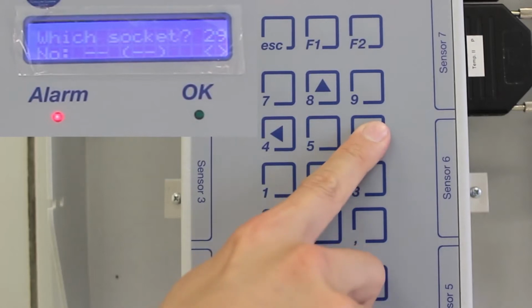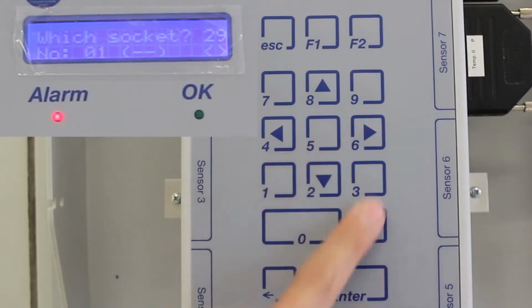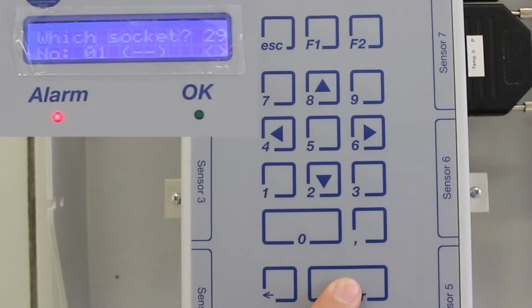Now, allocate the function to the socket where you plugged the power supply of the solenoid valve. For example, you've plugged the solenoid valve to socket number 1, and the following will show on the display. Select this socket. Sockets with no control settings yet have the following shown beside the number. Lastly, confirm by pressing Enter.